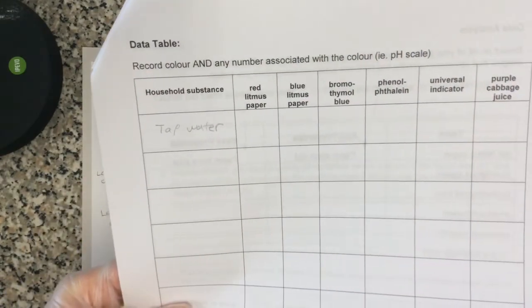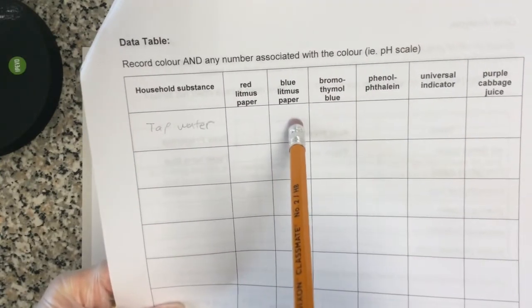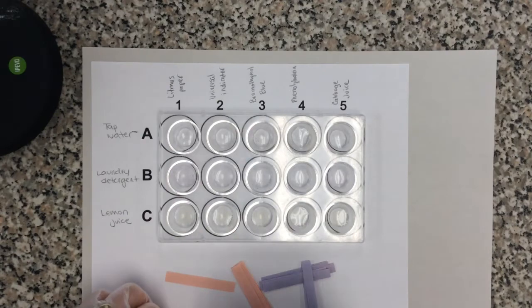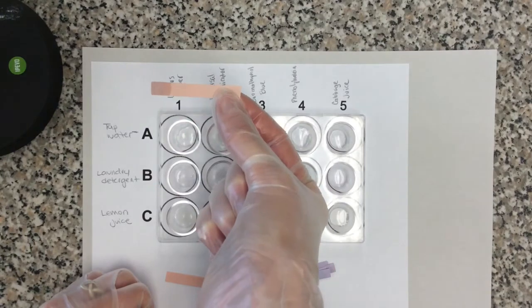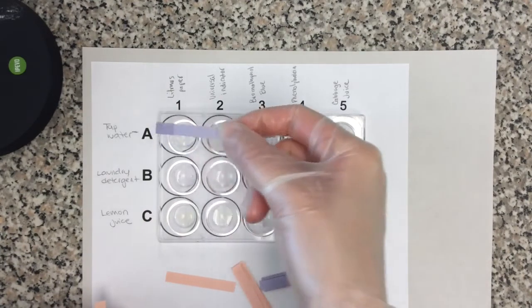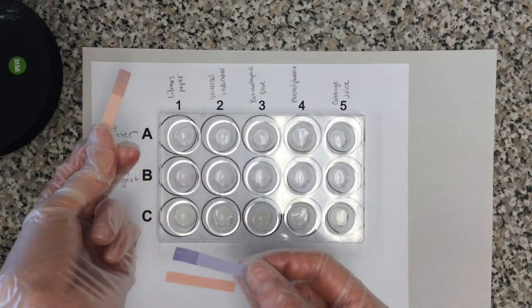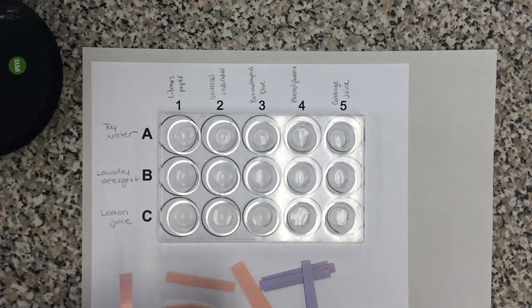Tap water. And I want you to write down what color it turns for my red litmus paper and my blue litmus paper, and then we're going to continue on with the other types as well. Okay? So, my red litmus paper, go ahead and dip it in. There you go. Okay. So my red litmus paper stayed red. My blue litmus paper stayed blue. Interesting.